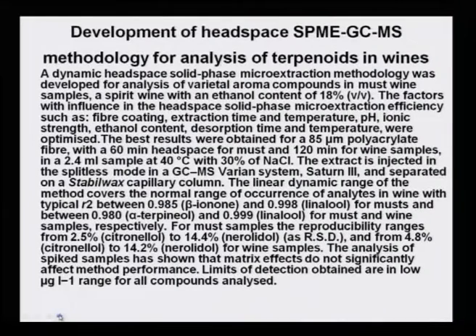Development of headspace SPME, when it is coupled with GCMS, is a very typical method for the analysis of terpenoids in wines.